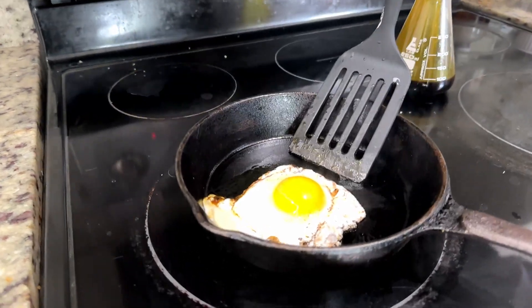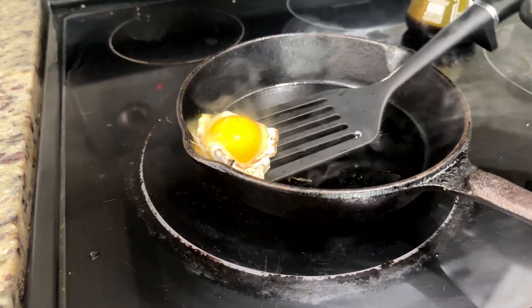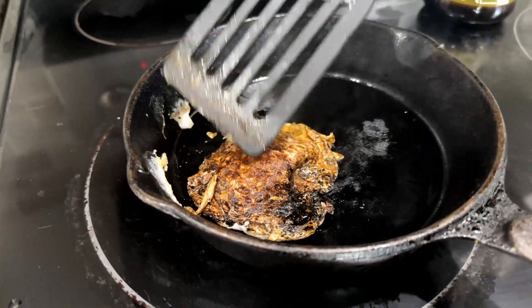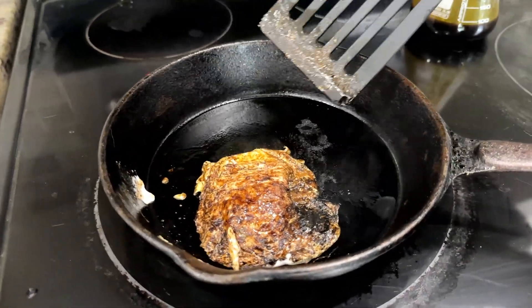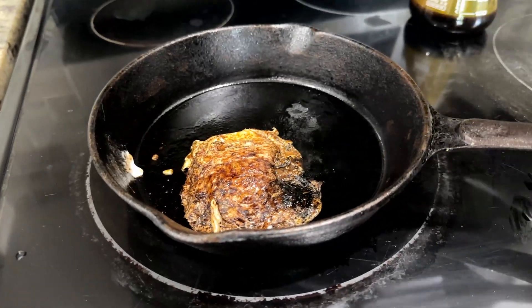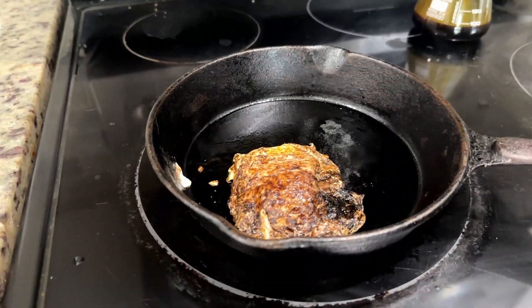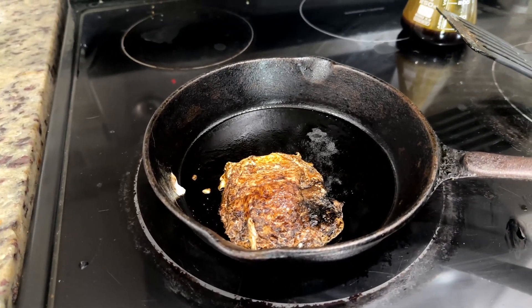Let's see if our egg is flippable. That is a horrible burn — that is ugly. Let's hope the bromine stained it and I didn't actually burn it. Side note: this oil does stain a lot of things, so if you're using any glassware or whatever, just be prepared — it might get stained and it's going to be hard to clean.